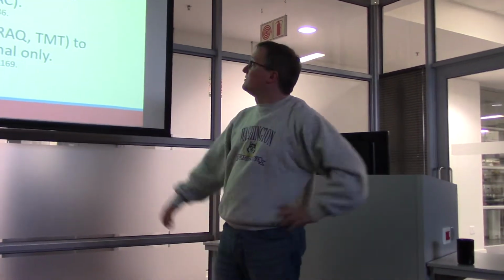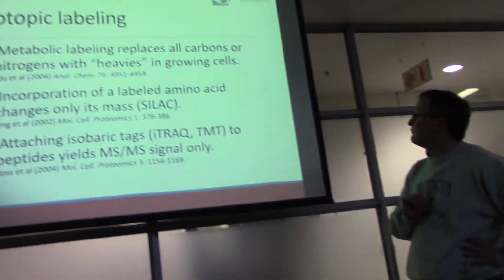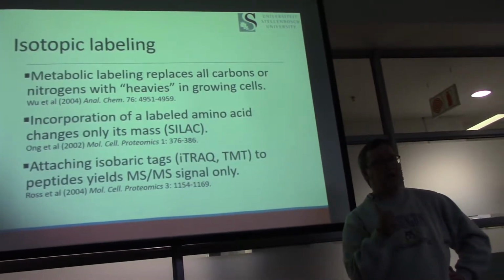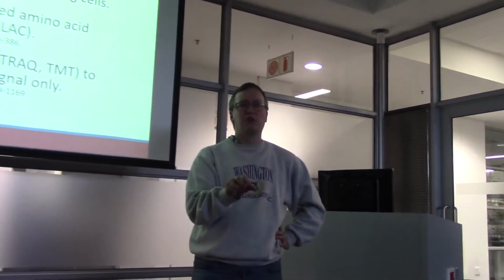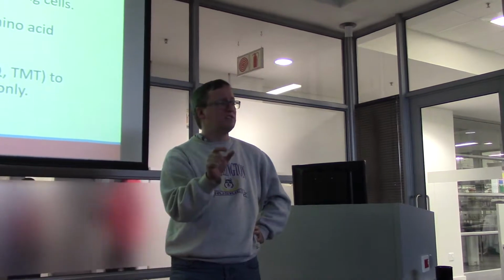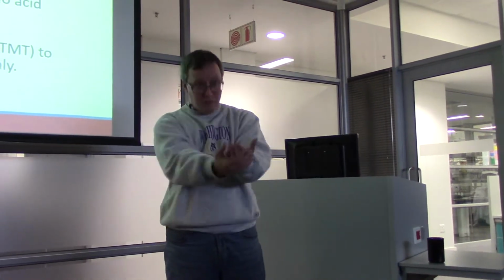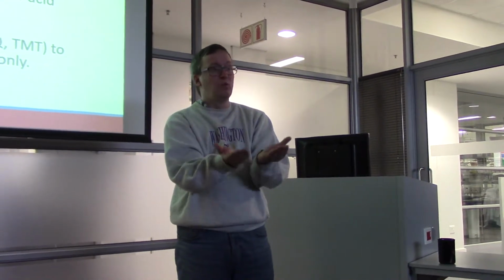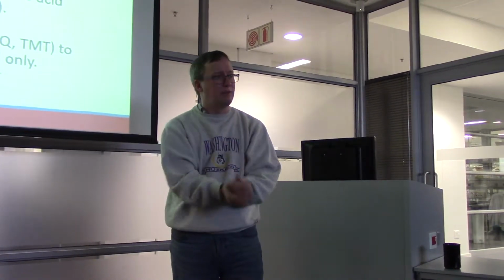All right. So back when I was in grad school, metabolic labeling was kind of the standard way to go. And remember I said that C, N, and O were the most common ways that we did this. So let's imagine you're growing a microbe on a dish. And let's further imagine that this microbe has no ability to grab carbon from something like CO2, right? So its carbon source on this plate of media is whatever sugar you put in there, if I'm being very general about it.